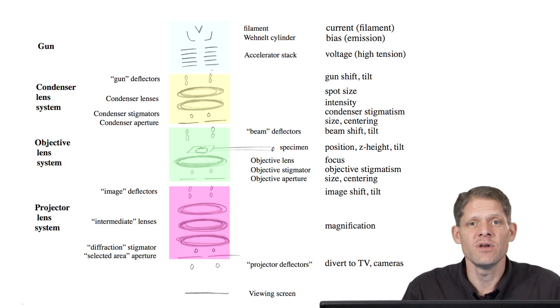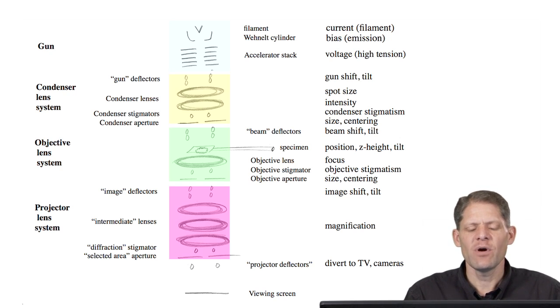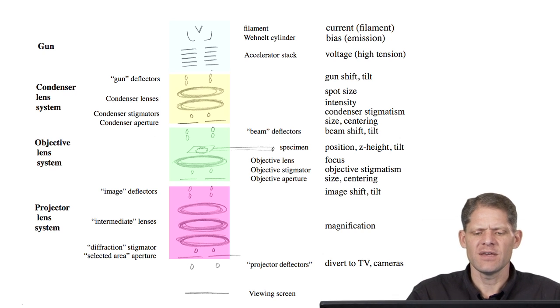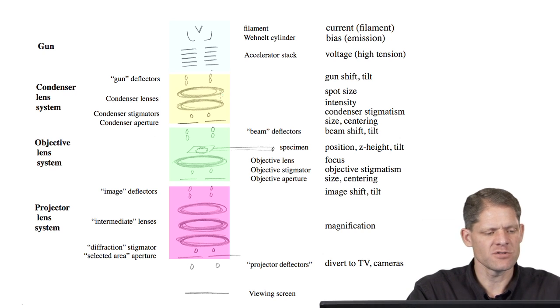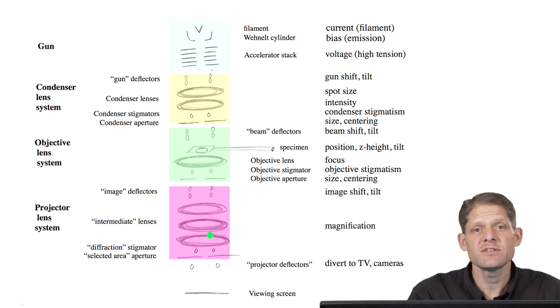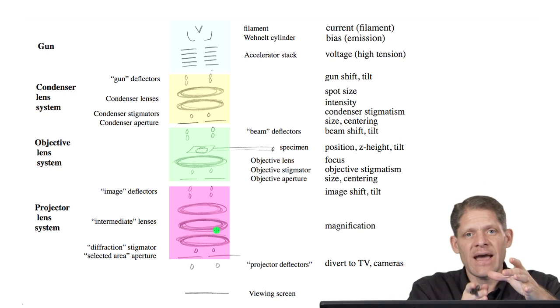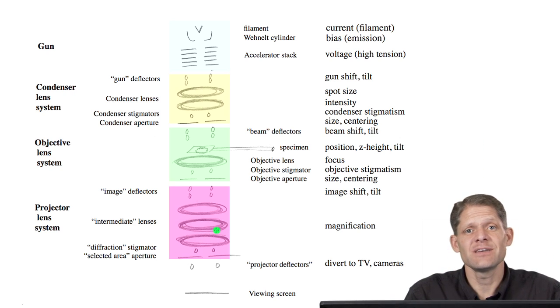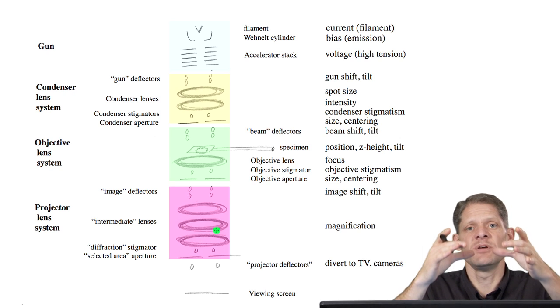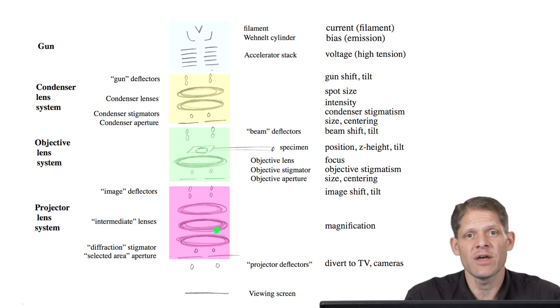Now, as you start to work with an electron microscopy group, you'll hear people talk about aligning the microscope. We're always talking about alignment. What it means to align a microscope is that when they build the microscope and assemble these lenses and all of the components on top of each other, they try as hard as they can to mount them exactly along one axis. But when you're talking about distances of nanometers, it's impossible to have each element perfectly physically aligned. And that, of course, is one of the reasons why you have deflectors.